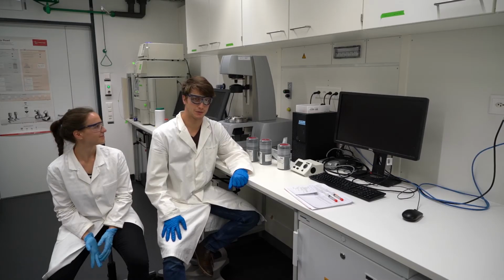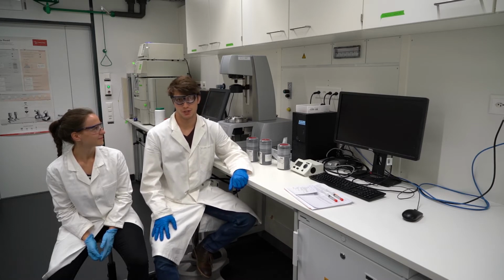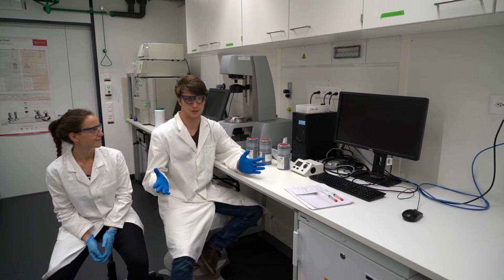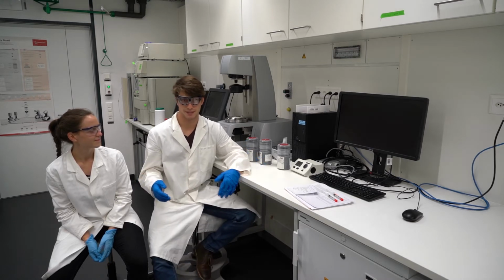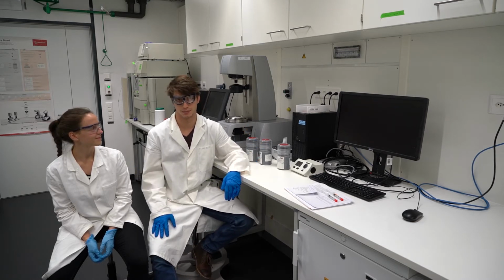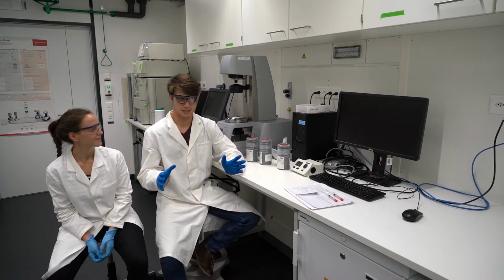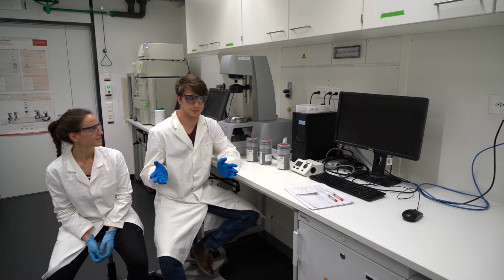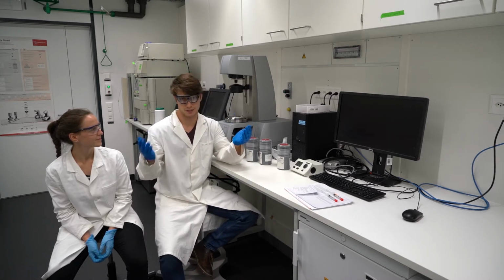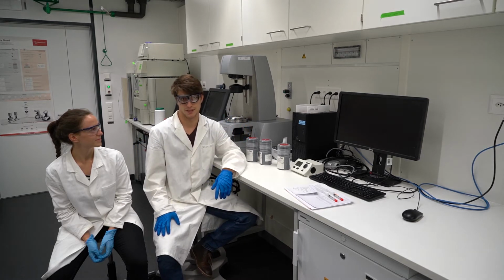Okay, we are here today to guide you through the rheological experiment, and we mainly use rheology for characterizing viscoelastic materials. But first, where do we find viscoelastic materials? If you think, we can find them everywhere, ranging from the cosmetic industry, food industry, and also 3D printing material. Today we are going to characterize them, and they are really interesting because we have these materials ranging from purely elastic to purely viscous, and we get both properties in these materials.